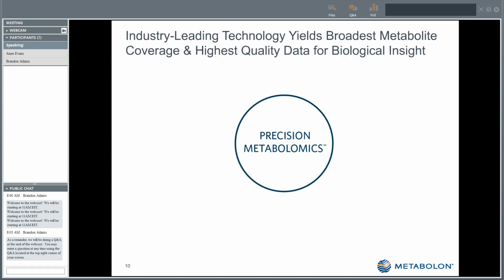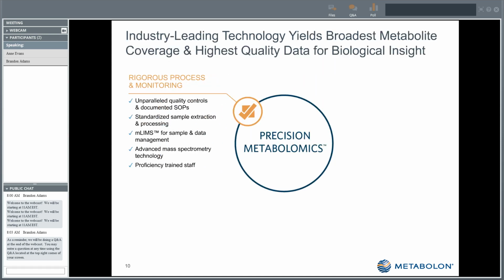So some of the things that we've put in place over the years with that goal in mind, some of these are not the most exciting things, but again, it's part of a quality management system. So things like SOPs, fully documented and maintained SOPs that are reviewed by multiple people and staff, fully standardized extraction procedures and analysis procedures which have to be followed and checked, calibration reports, a lot of documentation.